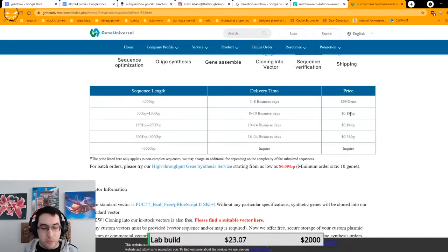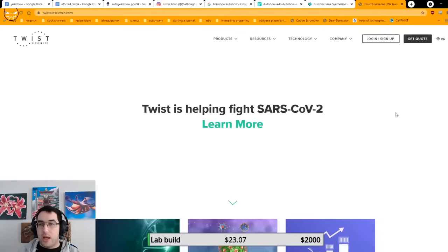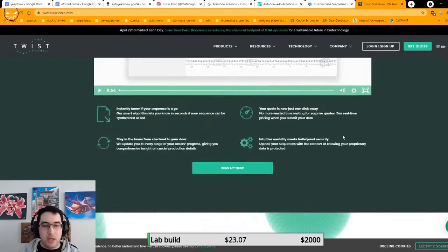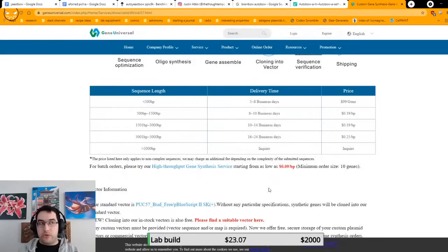Now, like I say, this is compared to Twist. Twist Bioscience is the company I was referencing before. These guys charge something like 9 cents per base pair. So they are far cheaper and they're very fast, but they are extremely picky about what they will and will not make, which is super annoying. Whereas these guys charge a little more, but their quality is incredible, and I've never had an issue with them. Above 5,000 base pairs, they'll just give you a quote, but we're going to use 25 cents just as a ballpark.